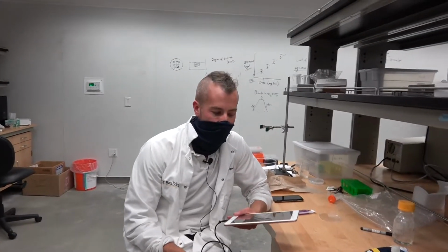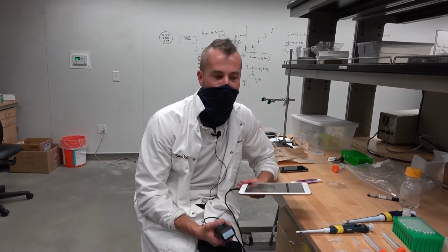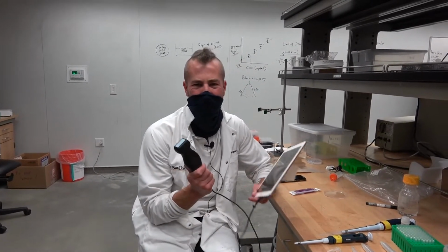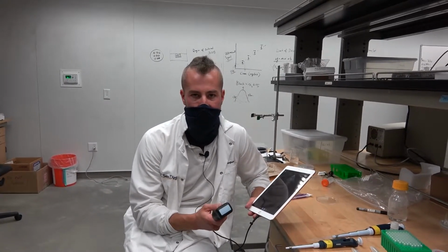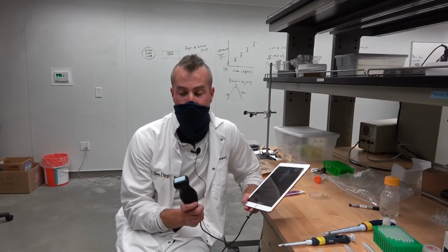Okay, so this is another one of those times where I just really wish that I could have you in the lab, because this is a really fun toy. The first few years I taught this class, we had this ancient, awful ultrasound system. And I got this a couple years ago. I love it, the students love it.